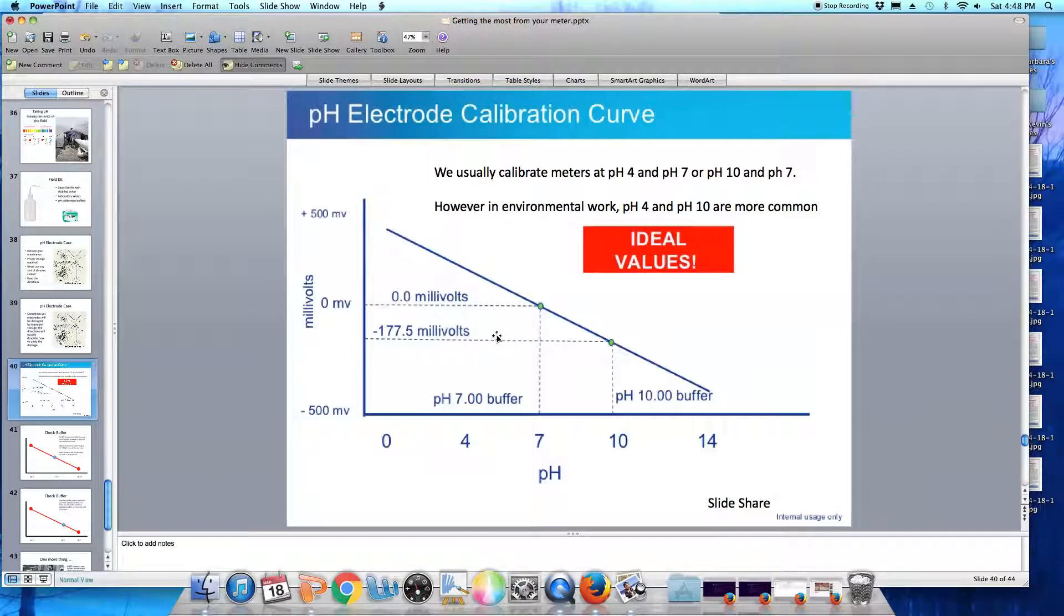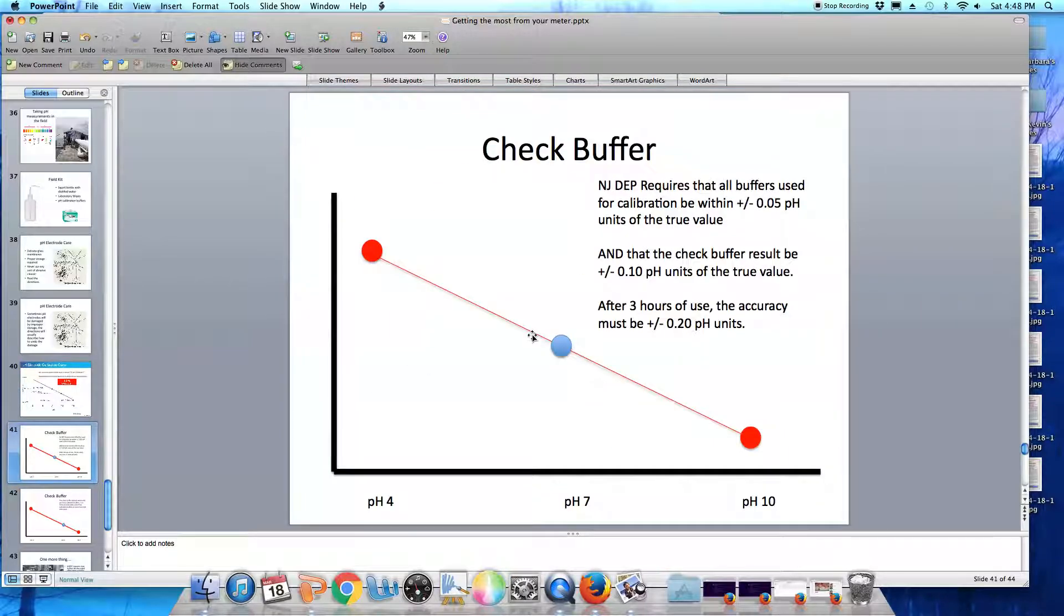In the environmental field, we generally do not know if the water we're going to be measuring is slightly acidic, less than pH 7, or slightly alkaline, more than pH 7. So when we work in the field, we generally calibrate between pH 4 and pH 10. Most of our water samples will be right around pH 7, from about 6.8 to maybe 7.2, occasionally a little more or a little less than those values. But if we calibrate at pH 4 and pH 10, we are going to have our meter calibrated for all of the likely pH values of our water samples.